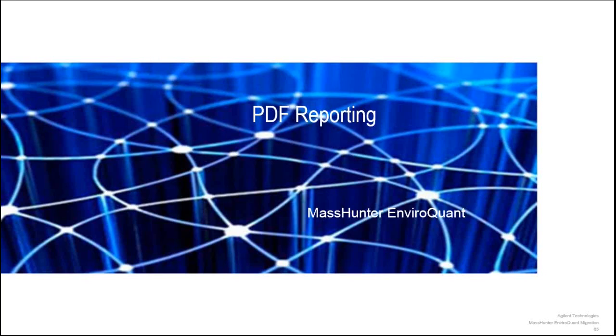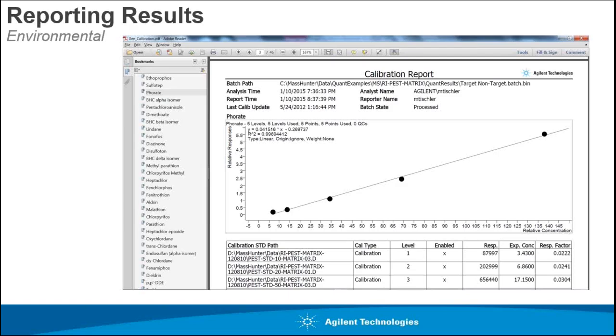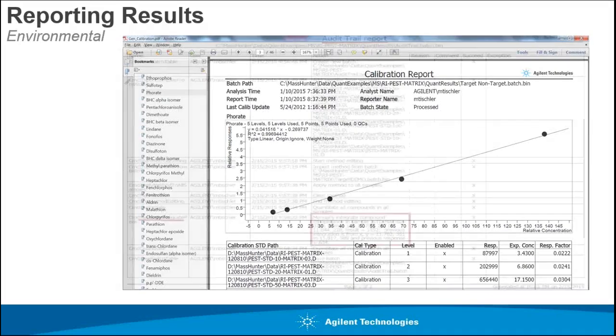Let me get to reporting, and then I'll take some questions. Reporting, we have a package that involves PDF reporting. PDF reporting does a great job of showing you the report.